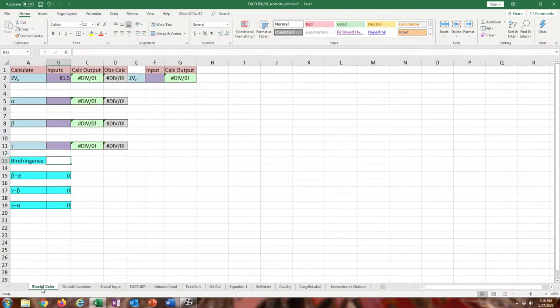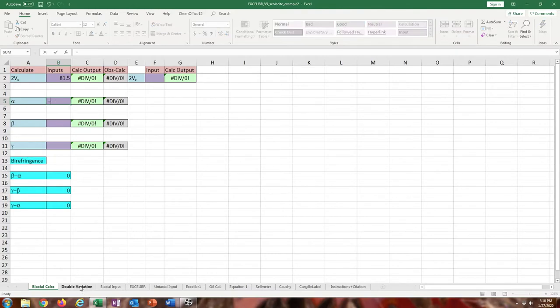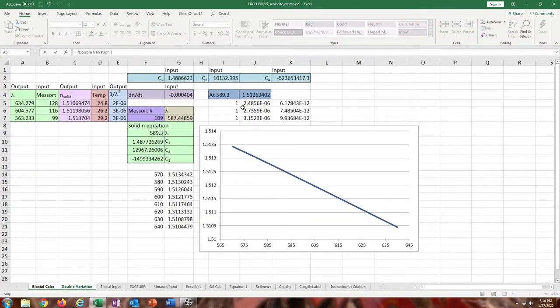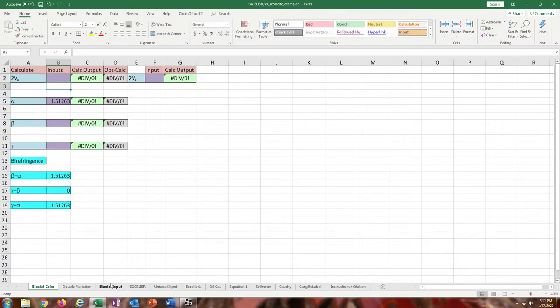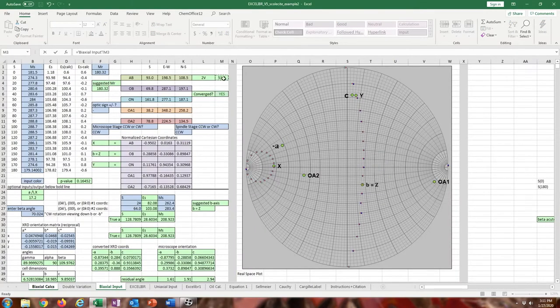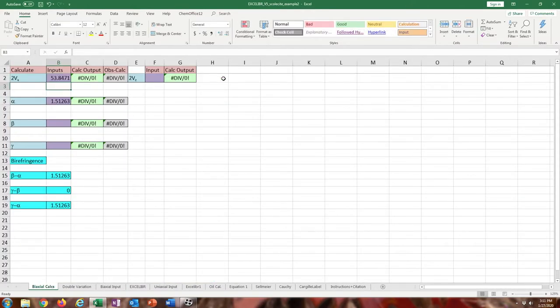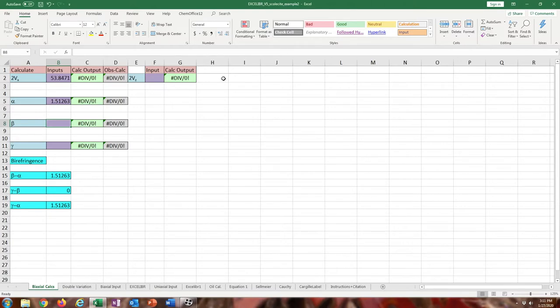In the biaxial calcs tab, you can enter that in. I'll just reference this cell, 1.5126. Then I'll create another spreadsheet for beta and gamma. Make sure your 2V is correct here. I'm just going to reference the biaxial inputs because this is from our optical determination. This will also calculate what the odd one out should be. If you have three of these four entries, it'll always be able to calculate the fourth, at least theoretically. Then it'll give you an observed versus calculated difference between them.